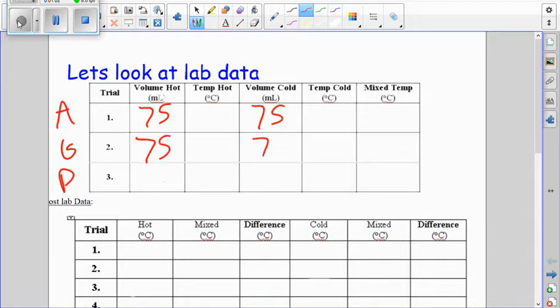Okay. All right, wonderful. I'm going to go ahead and get the temperature of Gabby's water here. Let's see. We're going. I'll get them both at the same time. How about that? So let's see here. Looks like Gabby's hot water is 26.4. So the temperature of her hot is 26.4. Temperature of her cold, we're coming in at 22.0.